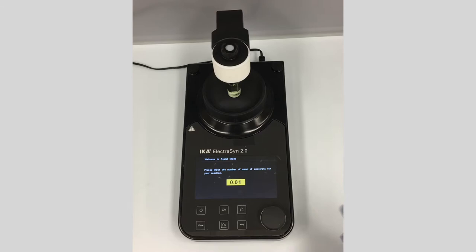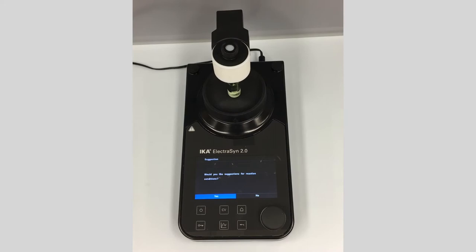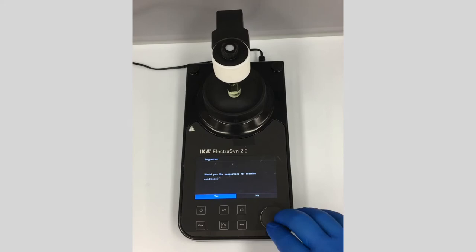Yu's been kind enough to mix this up for us. This reaction has 0.2 millimoles of substrate, so I'll input that and click OK. It then asks if you'd like suggestions for the reaction conditions — really helpful if you've never run an electrochemical reaction before. Click yes and it gives us some general guidelines.